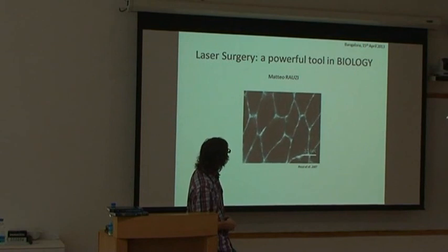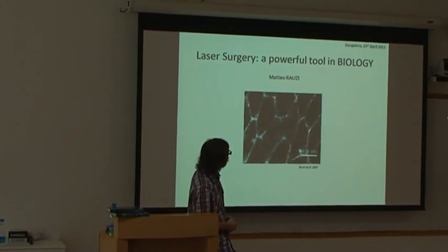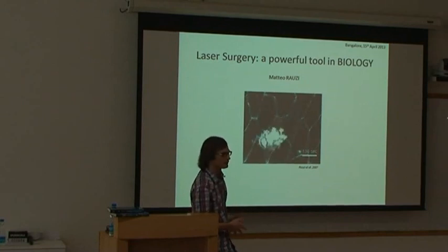And so this is a very interesting experiment. It was quite challenging at the time. And the idea was really to measure, in fact, tension along junctions. So to be able to dissect actin, which is along this junction. It's called junctional actin. And then see what happened.